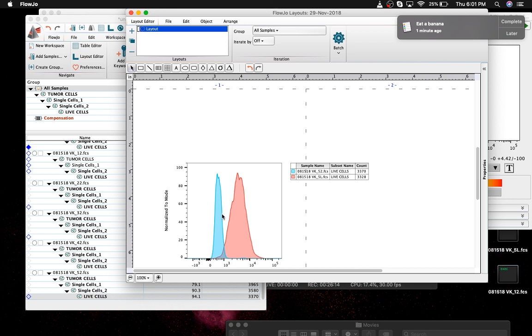Whenever you have to look for a certain marker on a cell, you would look for an antibody that is complementary to it, and then once you have the antibody, you could either conjugate a fluorophore onto that antibody, or you could use a secondary antibody which is complementary to the primary antibody, and that could give you a signal. So depending on the primary plus secondary and the only secondary sample, you could tell whether that protein is there or not.